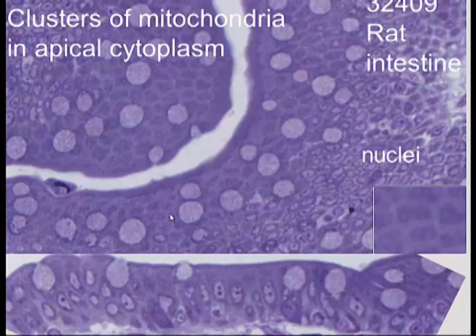So we can see brush border right in through there, height of a cell, nuclei, mitochondrial clusters. In a certain place you can see the cluster. Also, some places you might be able to see the junction between adjacent cells. In this case, you can see the junctions going through there around multiple cells. It's cut along the junction, and again you can see it here. Here you can see the terminal bars, but here they're continuous because indeed they form a belt around the cells.